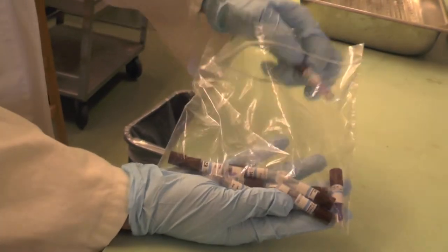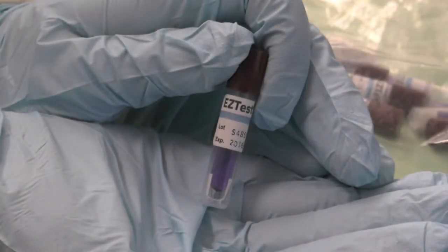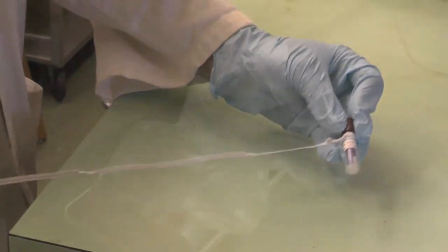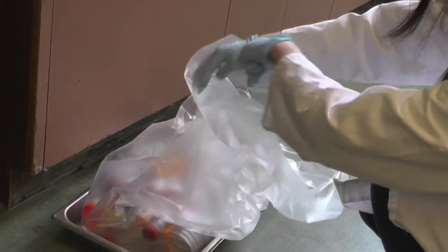Biological indicators should be used to verify the effectiveness of the autoclave on a monthly basis. To include a biological indicator with your load, first attach a string to it. Then lower the indicator into the bag, placing it at the center of the load. Make sure the strings hang out slightly.